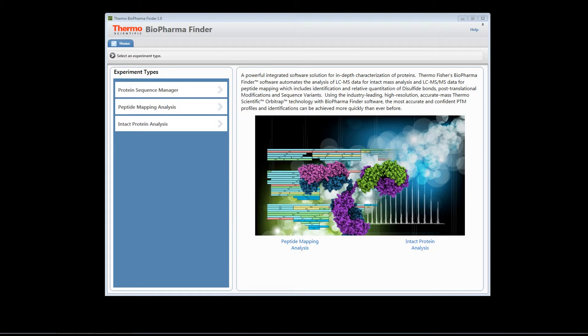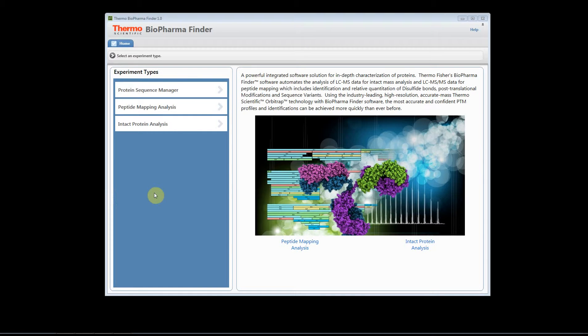Welcome to the BioPharmaFinder help video. In this help video I'm going to show you how to start a basic peptide mapping experiment. Here's the home page of the software.